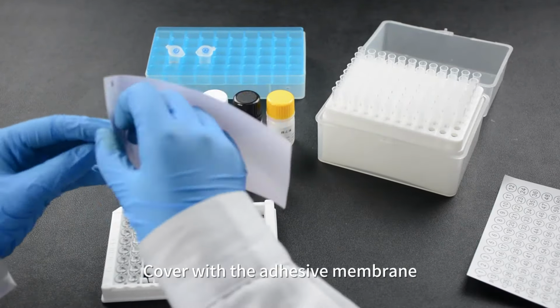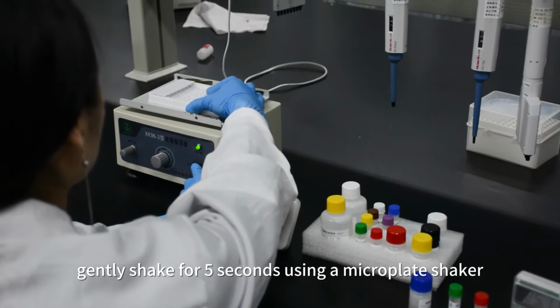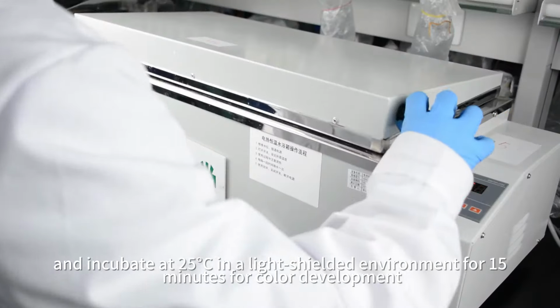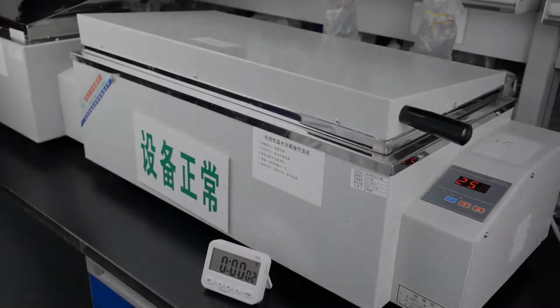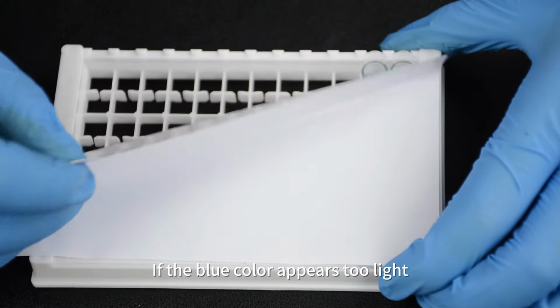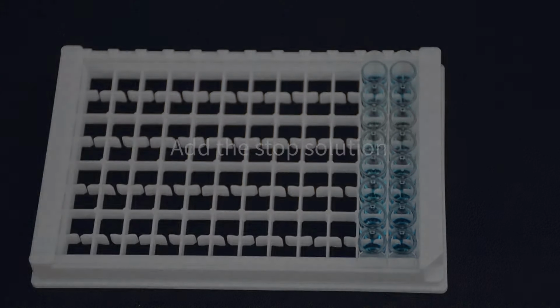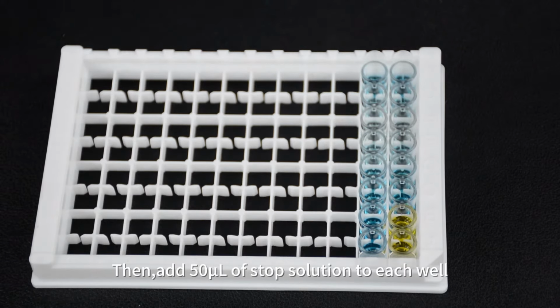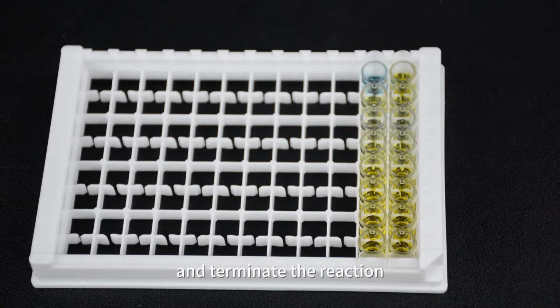Cover with the adhesive membrane. Gently shake for 5 seconds using a microplate shaker, and incubate at 25 degrees Celsius in a light-shielded environment for 15 minutes for color development. If the blue color appears too light, you can extend the incubation time as needed. Add the stop solution. Then, add 50 microliters of stop solution to each well, gently shake using a microplate shaker, and terminate the reaction.